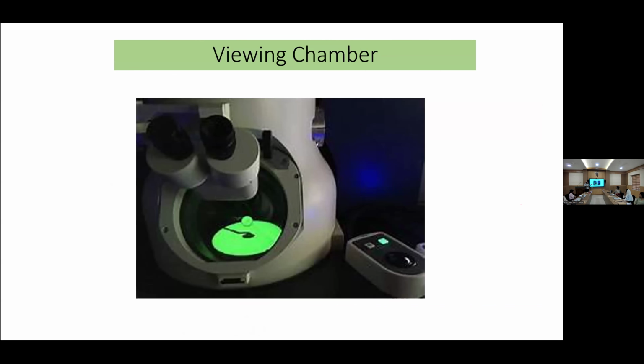This is a fluorescent screen. Here we are using an electron beam. We cannot see the electron beam without this.